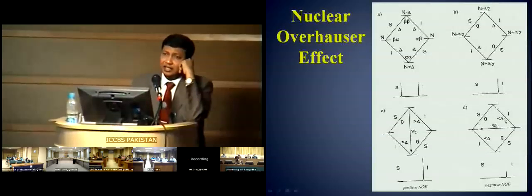Is this understandable? Okay, as a result, you see a negative NOE.